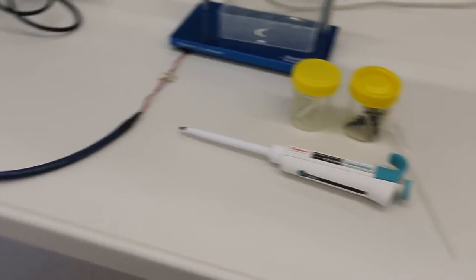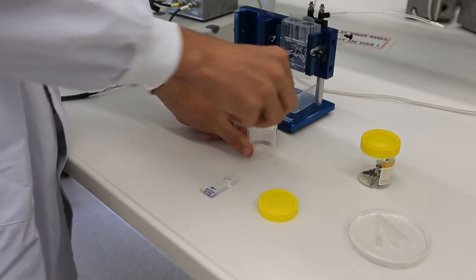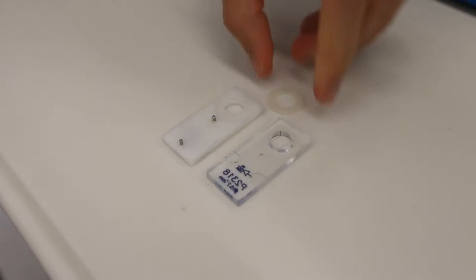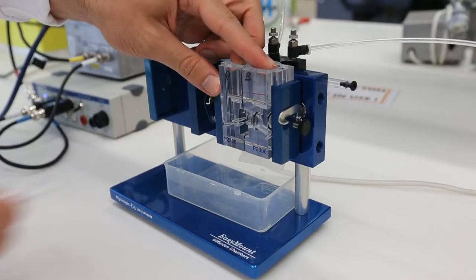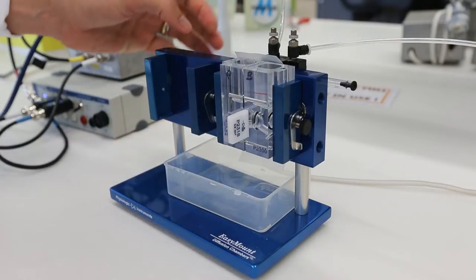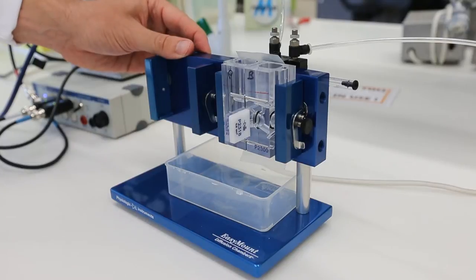Next, we will assemble the blank tissue holder. Take the specimen jar with the tissue holder and remove the contents. Place the washer into the white part of the tissue holder and then place the clear perspex part on top. And insert the assembled tissue holder into the Ussing chamber with the clear part facing the left. Lower the arms to lock the slider in place and use the knob on the side to squeeze all of the pieces together. The chamber is now prepared.